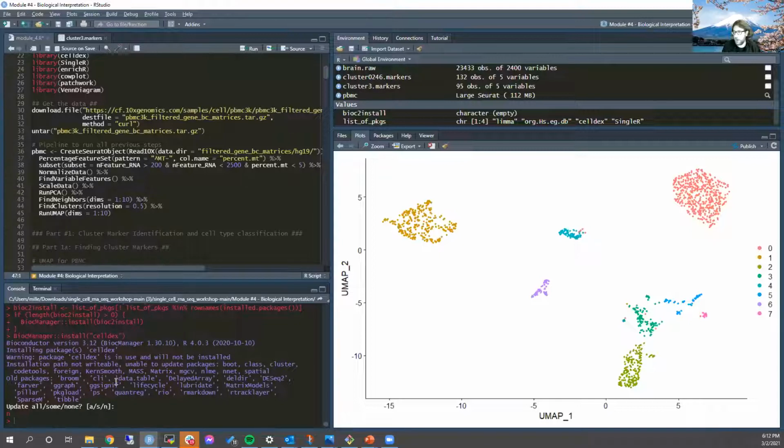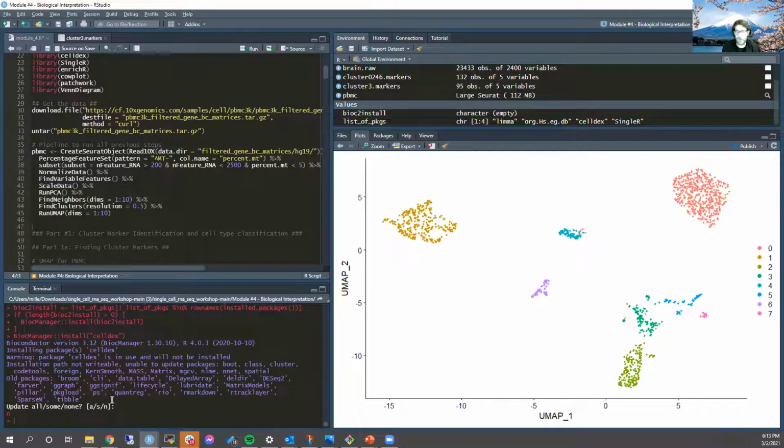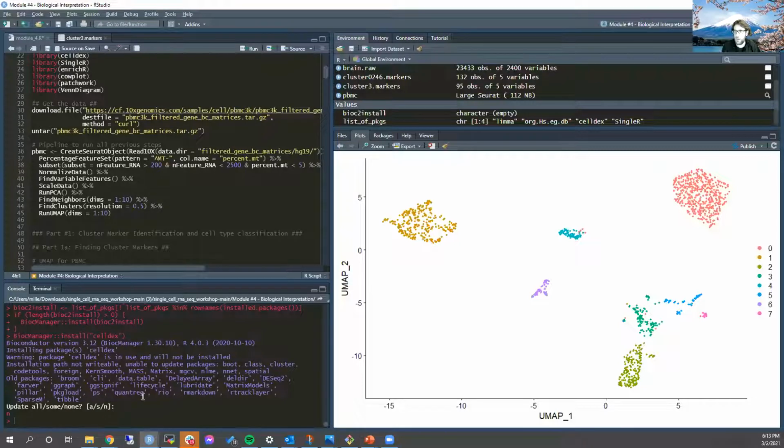If you get anything other than what I just got when you try to do that, put the exact text of what you got into the chat. Because if there's an error, then we can help you, but we have to know what the error is first. It's just a general rule of troubleshooting: put the text of the error into the chat.